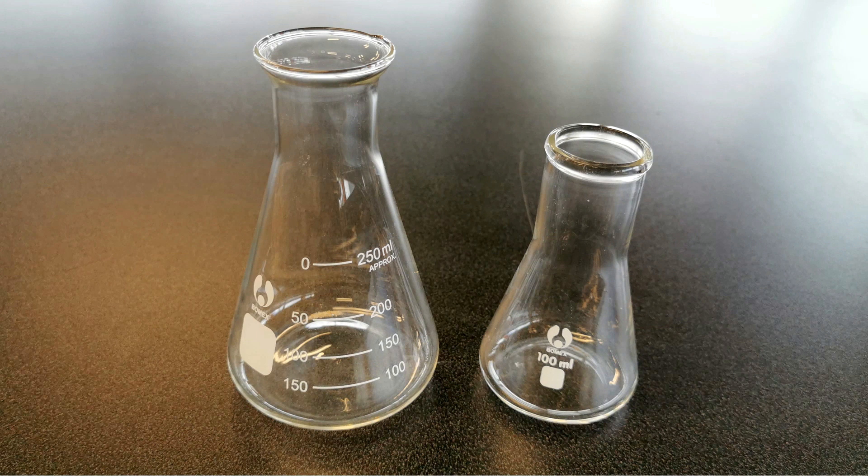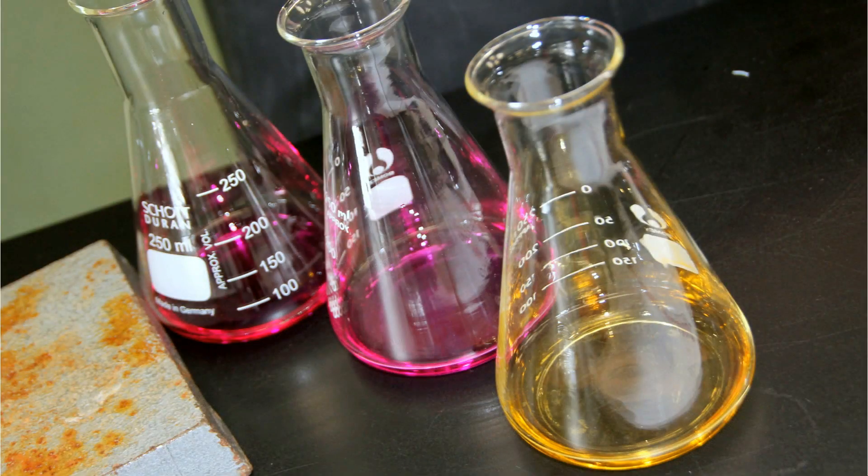This is — its proper name is an Erlenmeyer flask, but usually we just call it a conical flask because, funnily enough, it looks like a cone. Like the beakers, you can see markings where you could measure certain volumes of solution, but you wouldn't really — you'd use them to carry out experiments in.